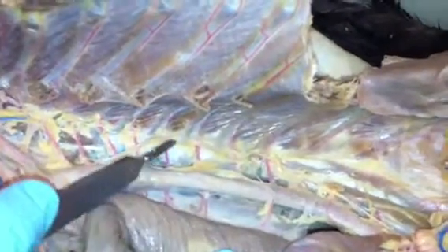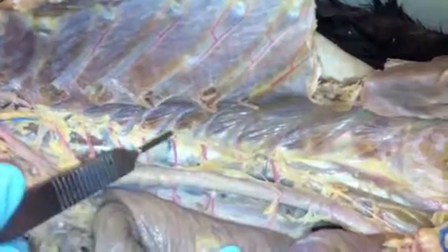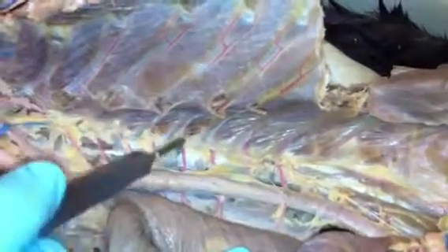On the left side of the lung organs, we have the aorta, which branches out into the posterior intercostal arteries. And then we go down to the hepatic portal, which is connected from the stomach to the small intestines.